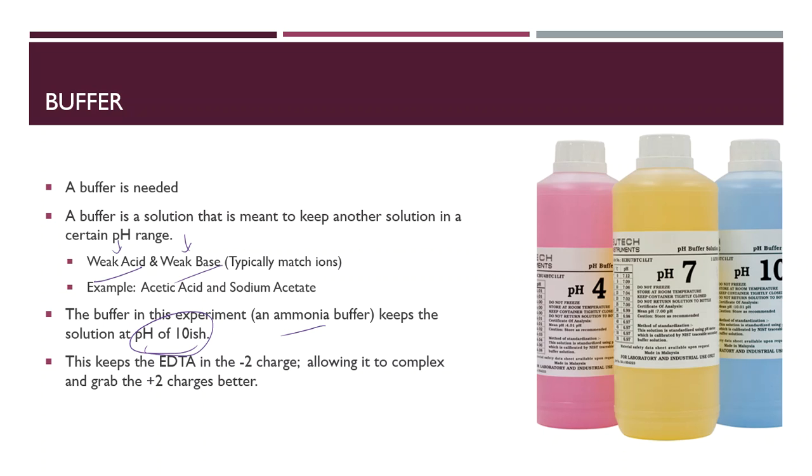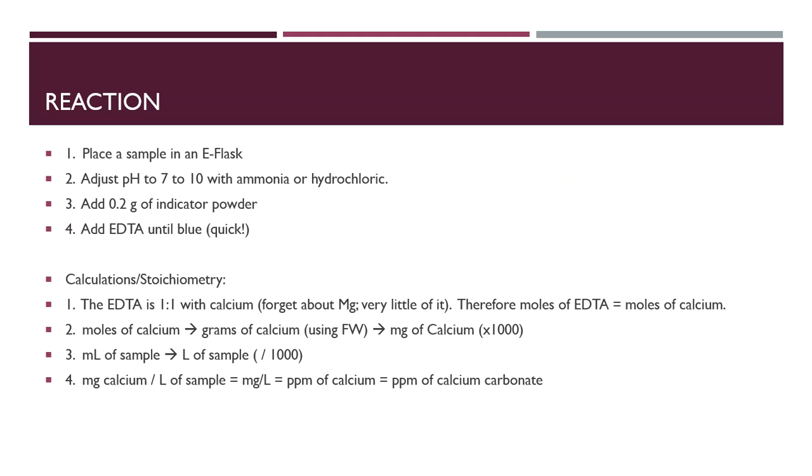And do not go and sniff this bottle. If you sniff this bottle, you're probably going to pass out because you're going to gag. It will stink and it will burn, and it will probably burn your eyeballs if you take in enough of it. So pretty strong ammonia kind of scented solution. So just don't go putting your nose where it don't belong, and just don't be sniffing bottles in a lab. I mean, that's all that I can say to you. It's basic lab safety. That's what this is. But that buffer, again, very, very important.